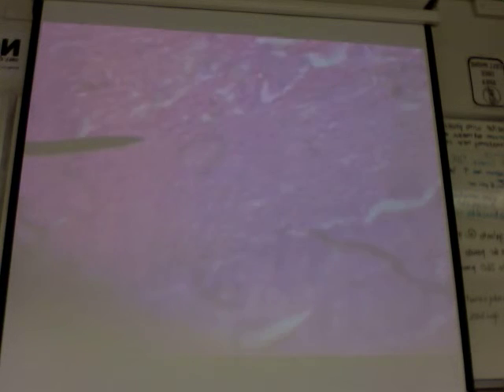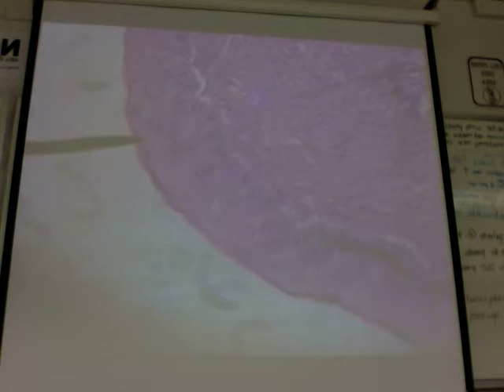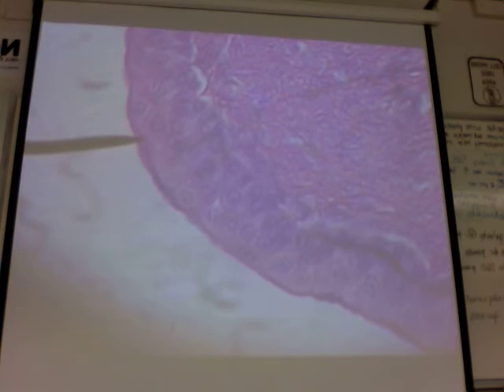So in the ureter, it's just smooth muscle, and then the bladder is detrusor? Yeah, they call the smooth muscle in the bladder detrusor muscle. That's just the name for it. It's still smooth muscle. Yeah, pretty good. Some transitional epithelium there.